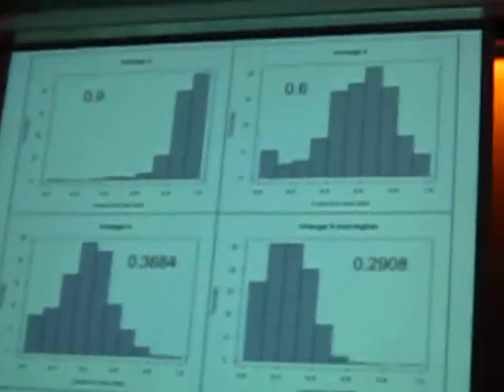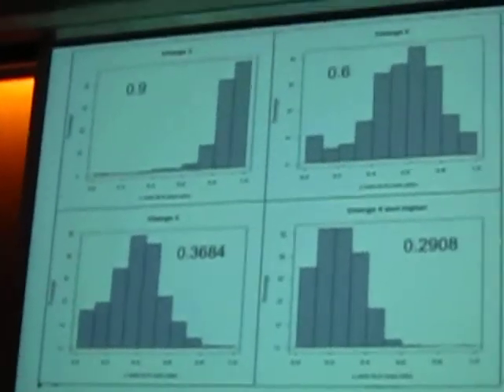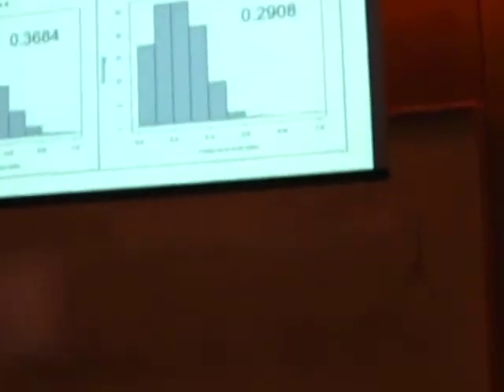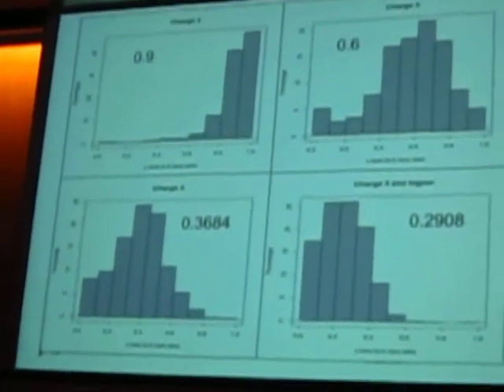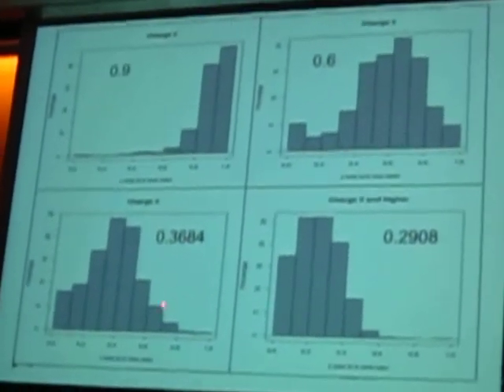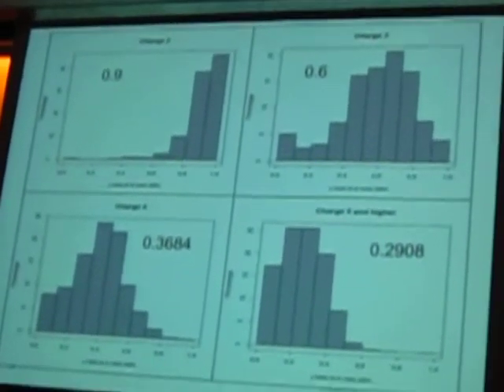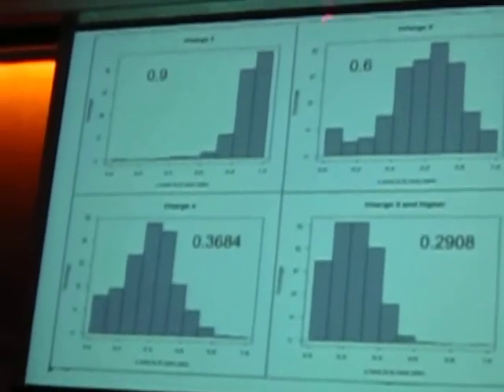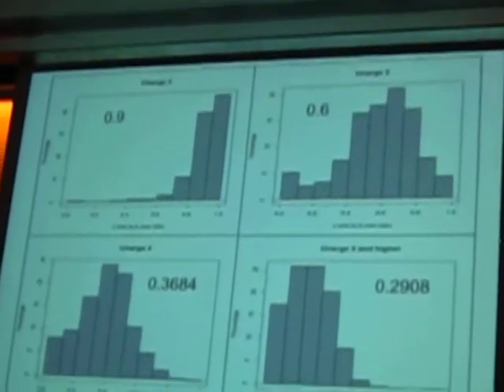If our observation is false and no complementary Y ions with remaining charge are present, then Y is always 0, and this ratio will look like 0, a big peak at 0. But that's not the case. You can see a distribution, and that's why our observation is not incorrect. The distribution is not perfect, because we cannot see a single peak at 1, where all the complementary Y ions with remaining charge were present. It's somewhere in between, but still it is usable. These values are the median value for each charge, and we actually take these values into account while we score our spectra.